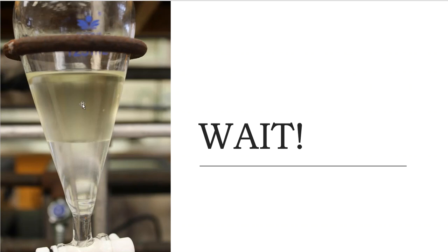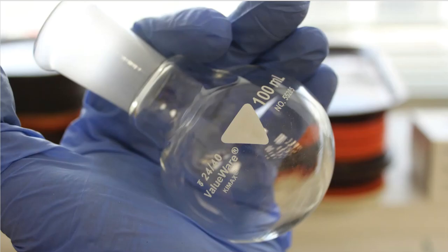Okay, so I'm getting ready to drain my organic now. The organic has been cleaned up. All of the impurities are hopefully out, and I just need to get my organic out of the organic layer, because keep in mind, there's solvents that are still here that I need to get rid of. So what that means is that I'm going to have to distill it off.